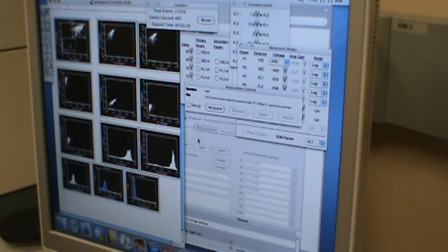And we want to do this as quickly as possible. Pull the base aside and pull these two immediately back. Pull this aside. Pull this one back. Put this one here and switch. I'm not sure how long it takes, but do it as fast as you can.